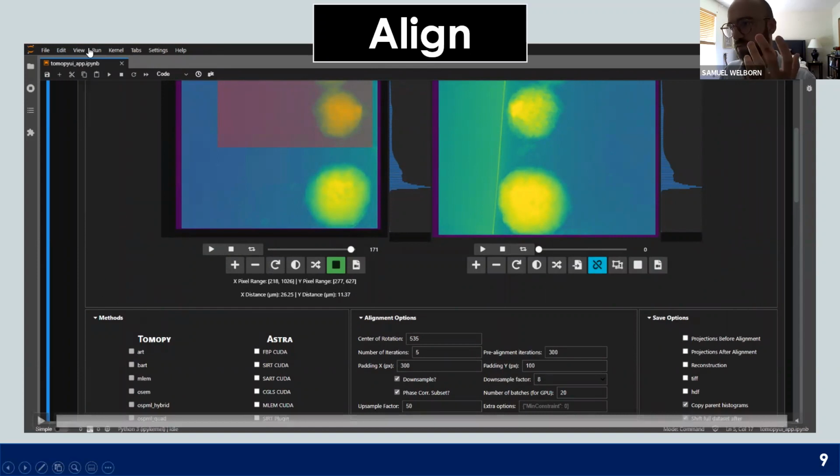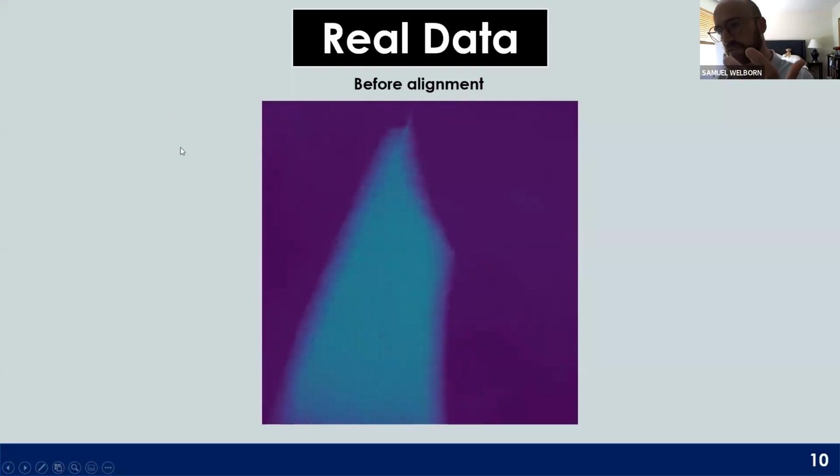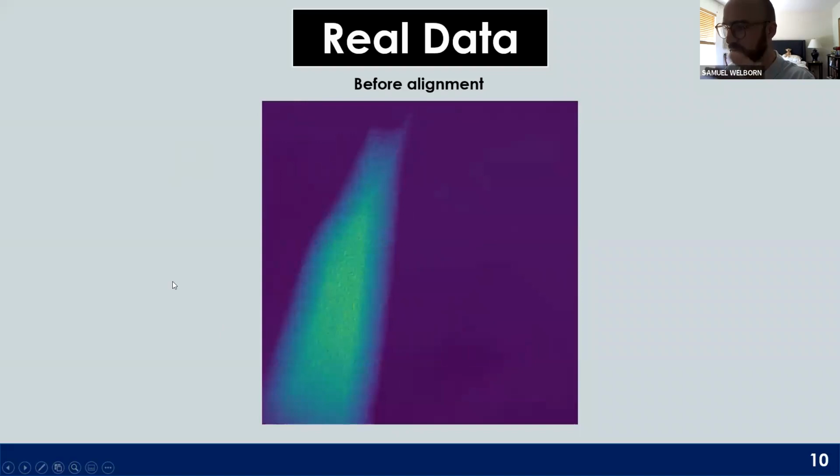So this is good in theory, but does it really work in practice? I have a couple of data sets that I'll show you that are real. This is the problem with nanotomography. Again, I might not have explained that for people that aren't familiar with this. There's this huge problem in nanotomography caused by the run out of the motors.